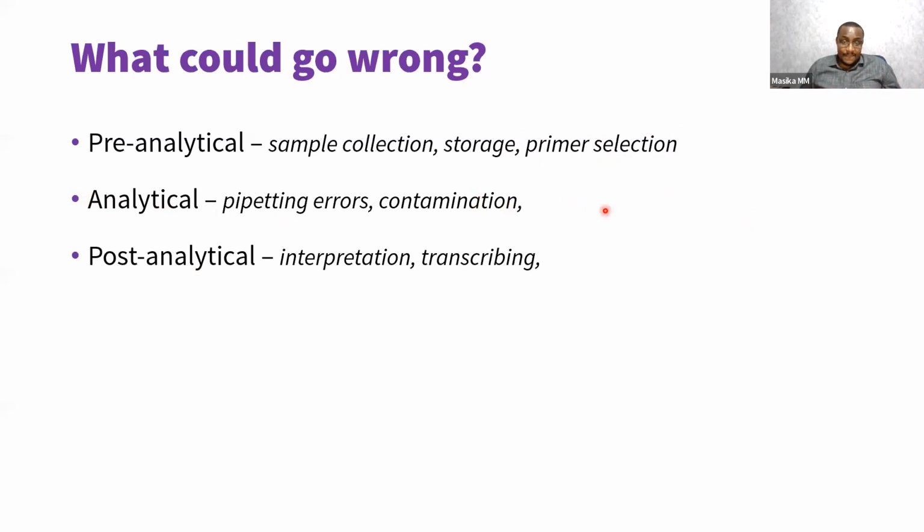Contamination can also occur. Now, especially if you tested a positive sample, remember it is 68 billion copies, and then you release that into the air by opening the tube. It can even contaminate your kits and other samples. So what we do is separate the procedures so that in the place where we are doing the amplification, we do not do any other process except maybe gel. The other processes are done in a clean room where there's less chance of contamination.